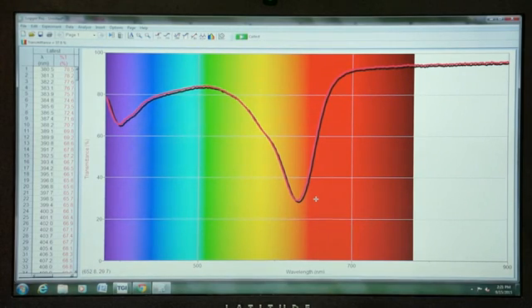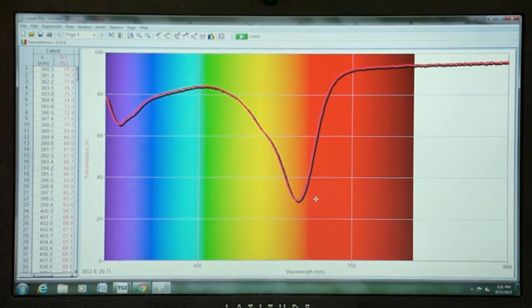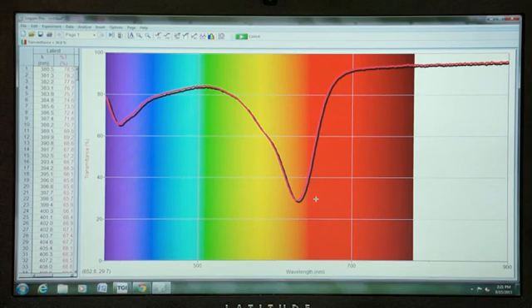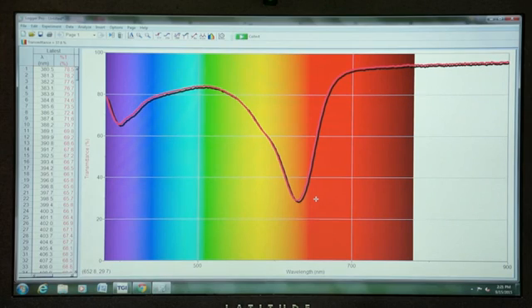There is a black shadow that goes along with the plotted points which can sometimes look like a second set of data. It is there merely to highlight the readings so that they are easier to see when the full backdrop is there.